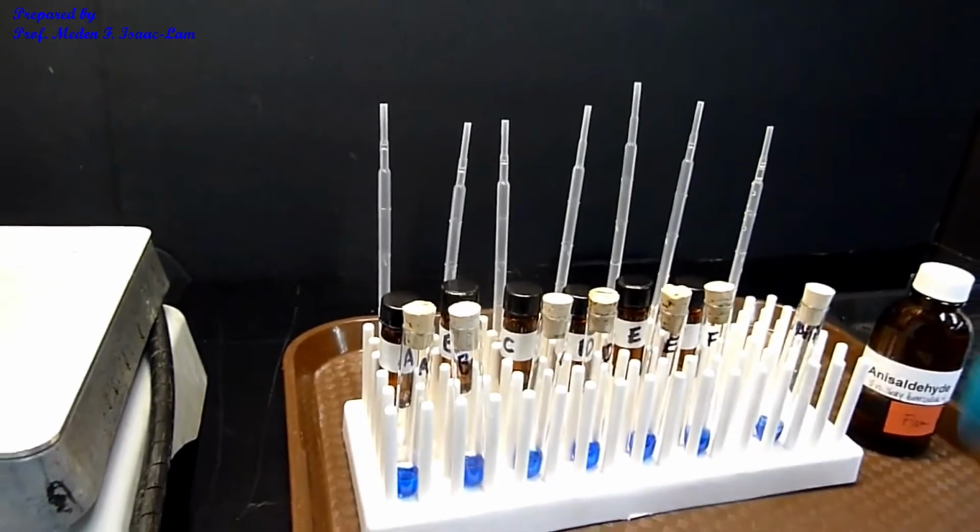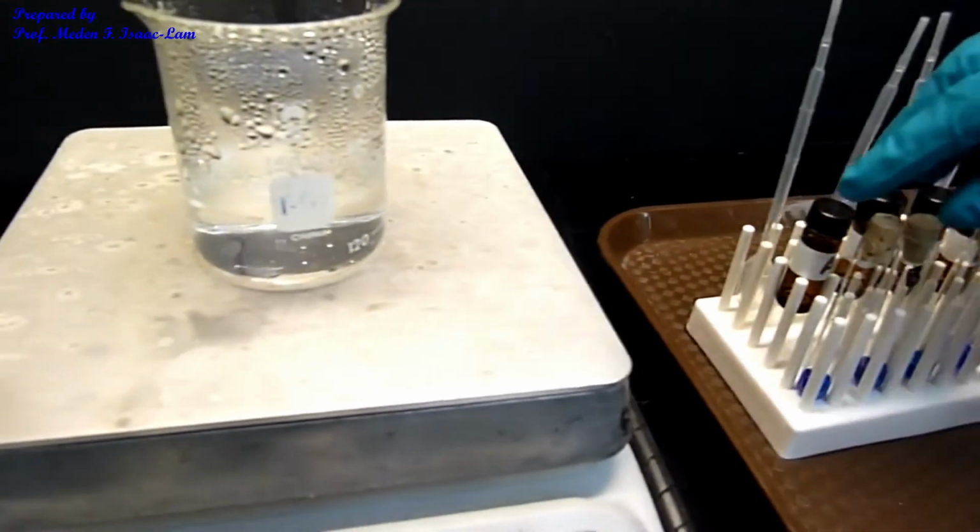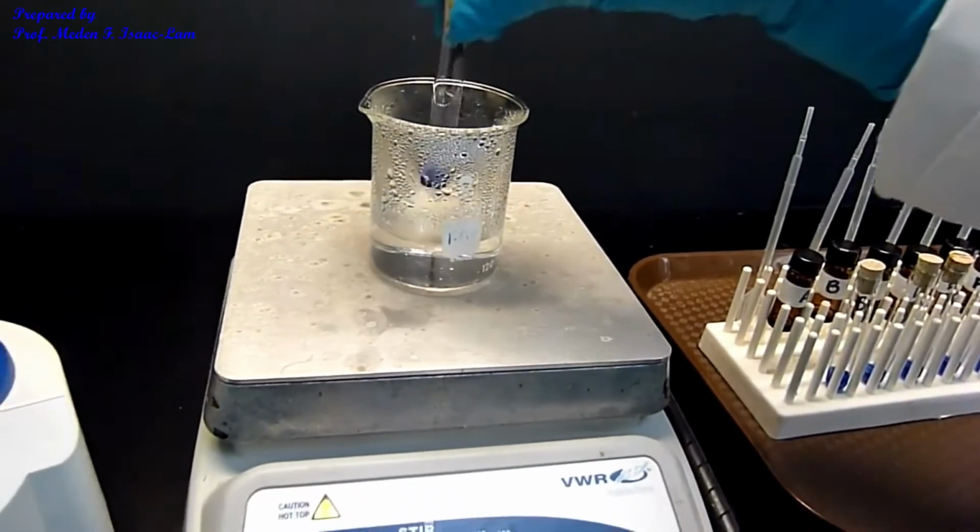So we are now going to boil the solutions in the water. So about 10-15 minutes, I'm just going to dip it in here.